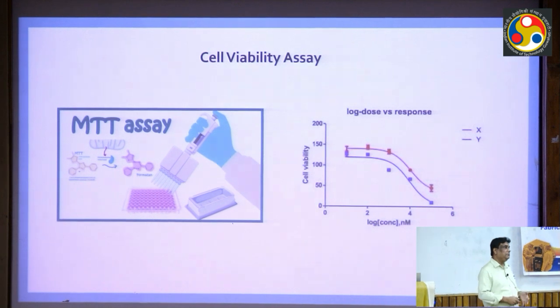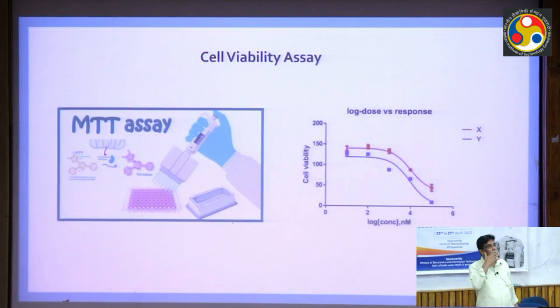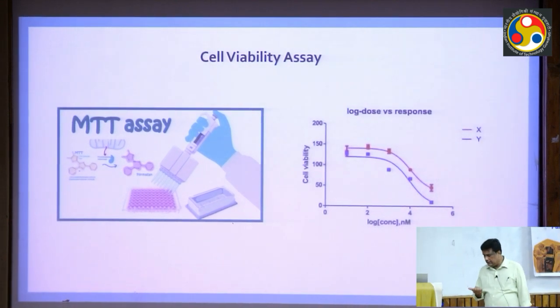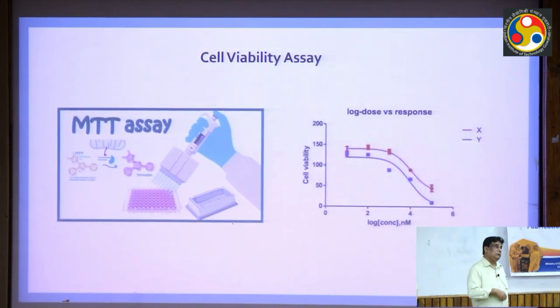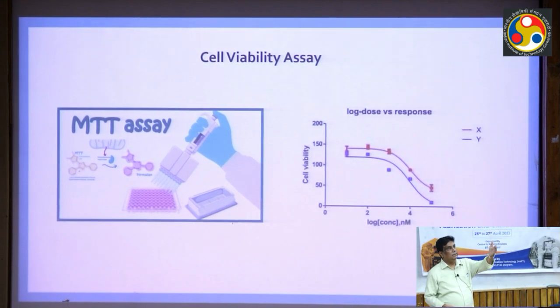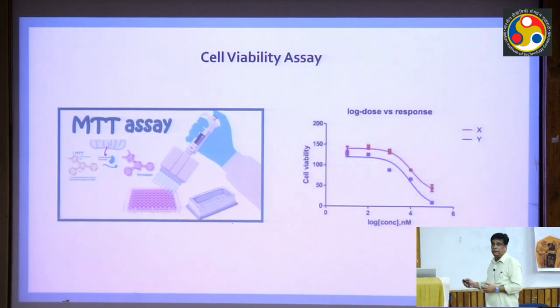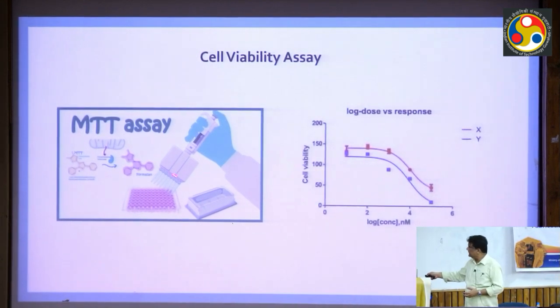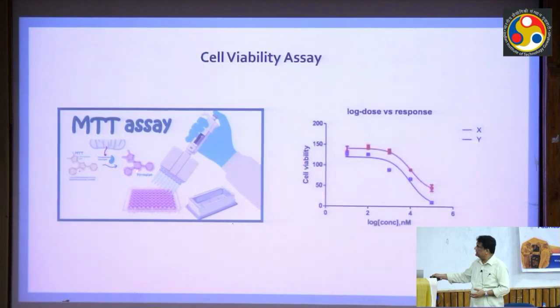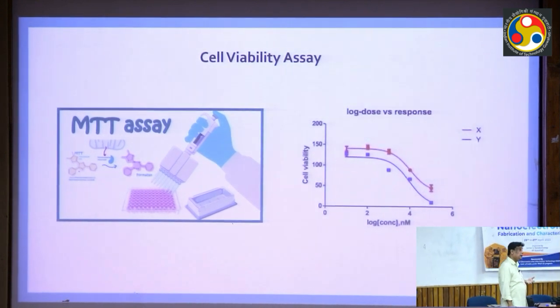Now, coming to some of the basic applications, right? That application part is very important when we talk about the confocal microscope, right? So in the cellular system, mostly in cancer cells, the cells are treated with different dyes or nowadays potential nanomaterials to kill the cells to get a therapeutic index, correct? So a classical assay is done with a formazan dye called the MTT assay, where it is a plate reader based assay, 96 well plates. As you can see here, there is a conversion of the dye and you see a color. So that color actually can be seen by your ELISA plate reader.